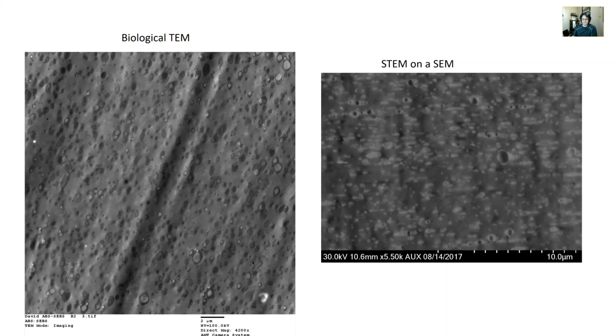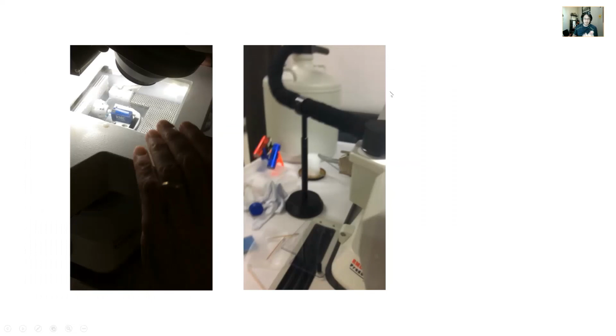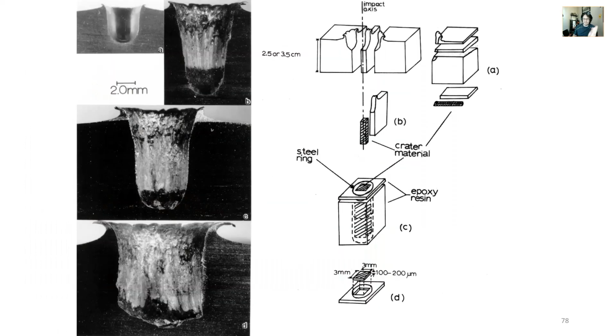And so advantages, disadvantages. The biggest disadvantage I have using my system is that I can look at 12 specimens at a time. So if you look back here, this is a very tedious process. Even this is a tedious process. Maybe you'll make 10 specimens and maybe one will be viable that you can actually get a good image off of.